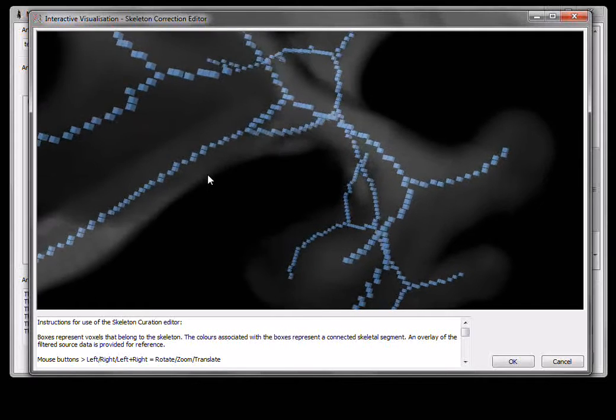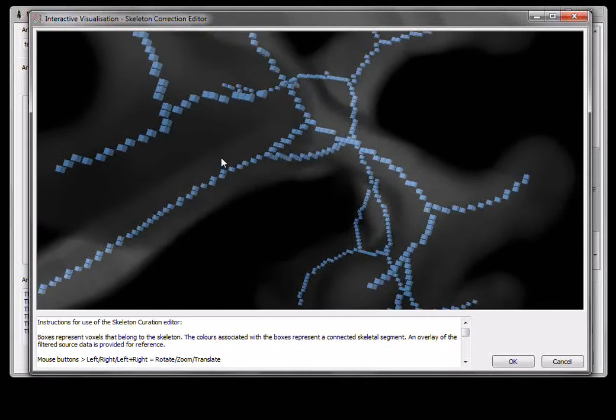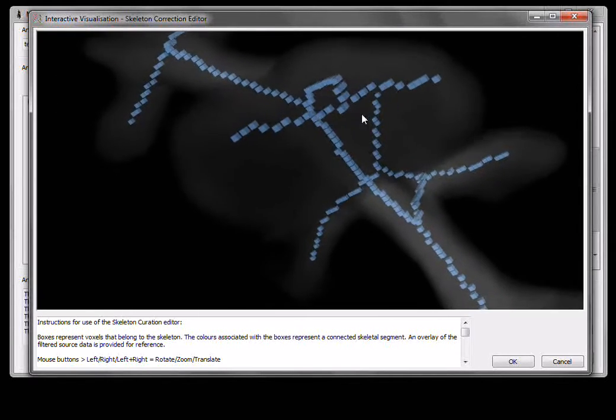Here we go. And if we're not happy with that branch position, for example, I could delete there, just delete that group of two with Control Delete, and I'll select that one and that one, and I'll join them, and now I've got a new position. It's really important to ensure, if that is done, that you've not broken the boundaries of the volume.